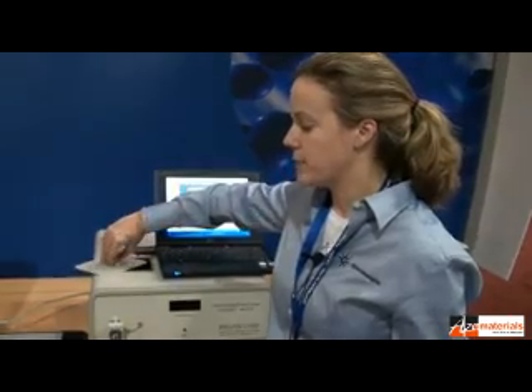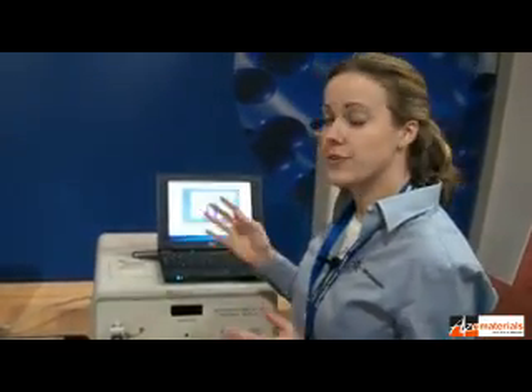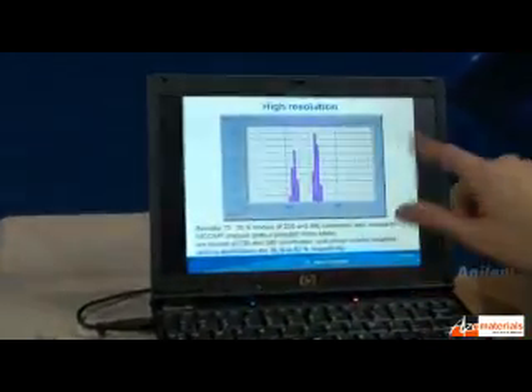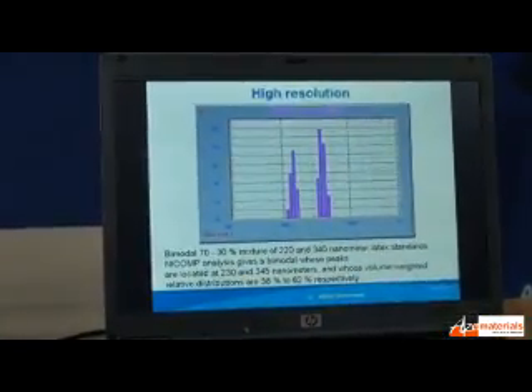Right here on the top you would open it, insert your sample, and close it. The results that you would get are very similar to what's on this screen. It's very high resolution — it can give you bimodals or trimodals depending on what you're looking at.